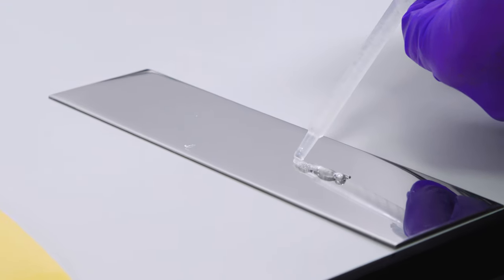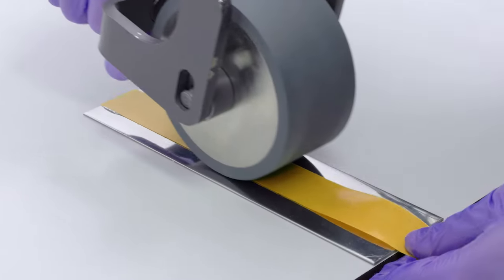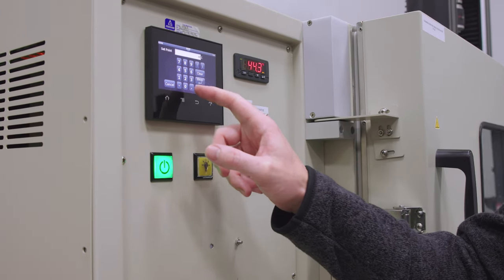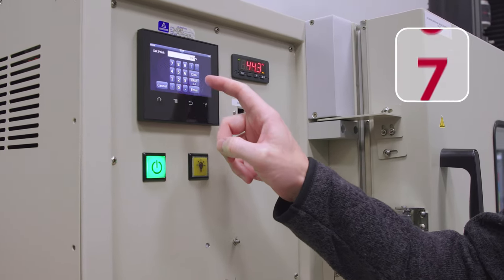Specimens are built by applying adhesive to two substrates. The specimen is then conditioned by exposing it to a monitored temperature and humidity for a period of seven days.